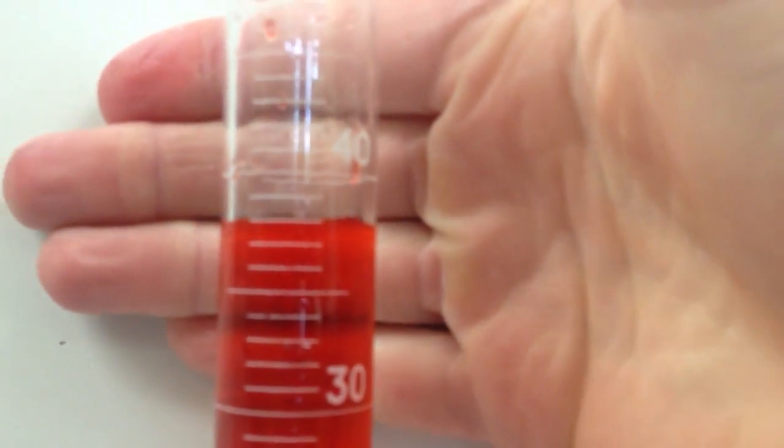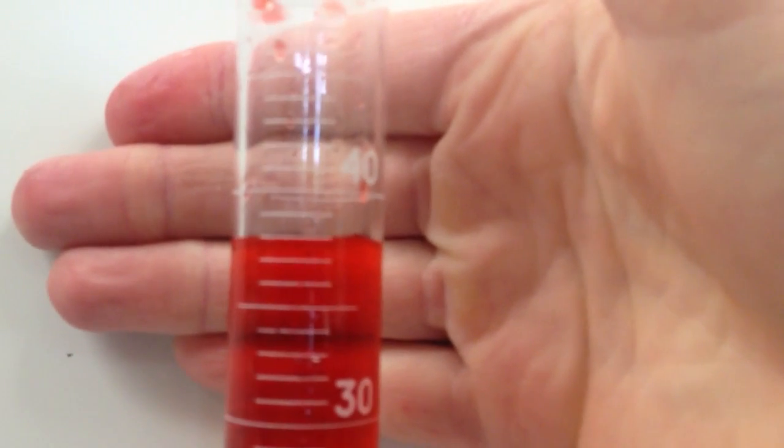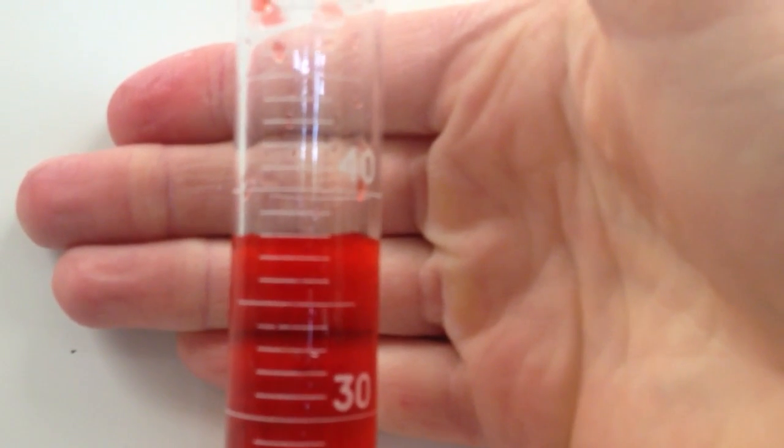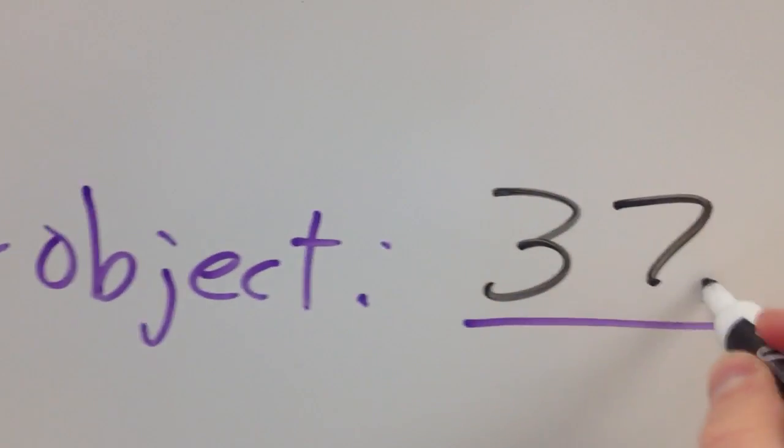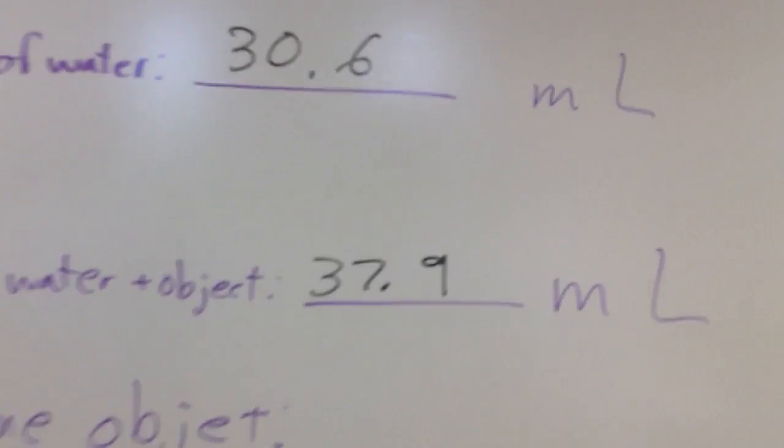Alright. Now I've got a new volume. This time my volume is 35, 36, 37. It's not quite to the 38. The line is a little bit lower than the 38. You can't really see it that well on the video here because I'm using an iPhone. So I'm going to say it's 37.9 milliliters.